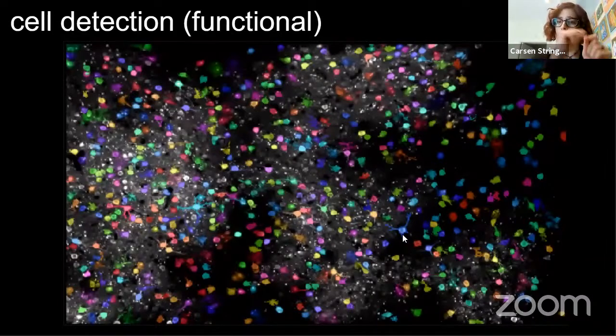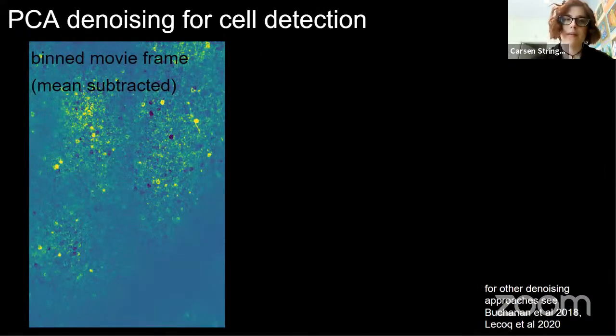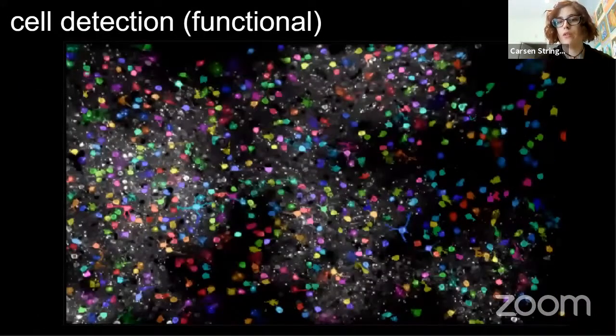But you will have instances of dendrites that you will find with Suite2p, and I might show some more a bit later when I'm talking about the classifier, that are separate from a soma. That's just because they weren't actually correlated to a soma that Suite2p could find in that plane. So in that case, they will be separate. But there's no preference either way. It's just if the pixels are correlated at some threshold with the seed, then they're going to get included in, as the cell is growing. Good question.